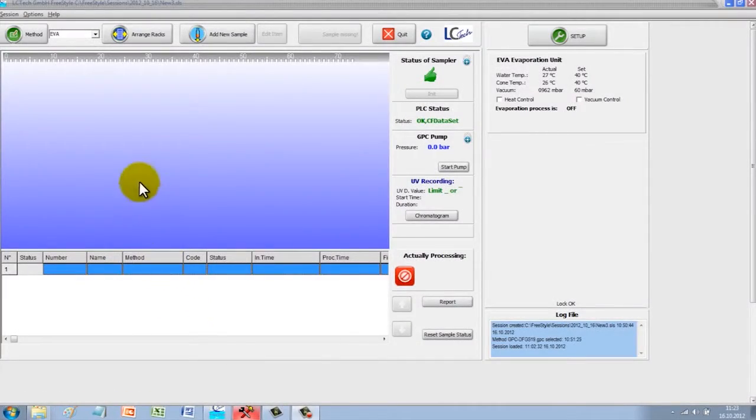The strong mechanics have been paired with powerful software. The software is split into two parts. Part one is for your everyday routine work. Here, the main emphasis lies on ease of operation and the quick setup of a sample sequence.